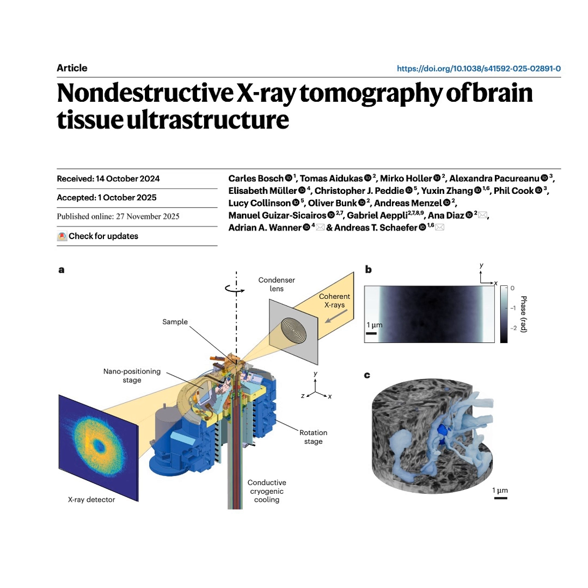Precisely. Even with the TGPAP and the cryo cooling, when they looked at their first results, the resolution improvement just sort of stalled out around 70 nanometers. Why? I mean, they minimized the damage, but it didn't just disappear. Correct. The high dose still caused these subtle residual sample deformations. We're talking micro movements, maybe a slight softening of the resin over hours of exposure, or tiny thermal effects. And these tiny shifts just blurred the final 3D reconstruction. Exactly. It stopped them from hitting the theoretical resolution limit.